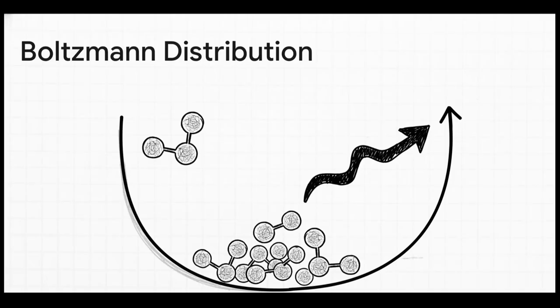Now, here's a super fascinating quirk of physics. Even though pure quantum mechanics dictates that both of these Raman paths are equally likely to occur, reality is governed by the Boltzmann distribution. In nature, the vast majority of molecules are just resting lazily in their ground vibrational state at room temperature. They literally have no extra energy to give. As a result, Stokes scattering, where the molecule takes energy, is statistically far more probable. This makes the Stokes lines much, much more intense, and the primary target for our actual laboratory measurements.